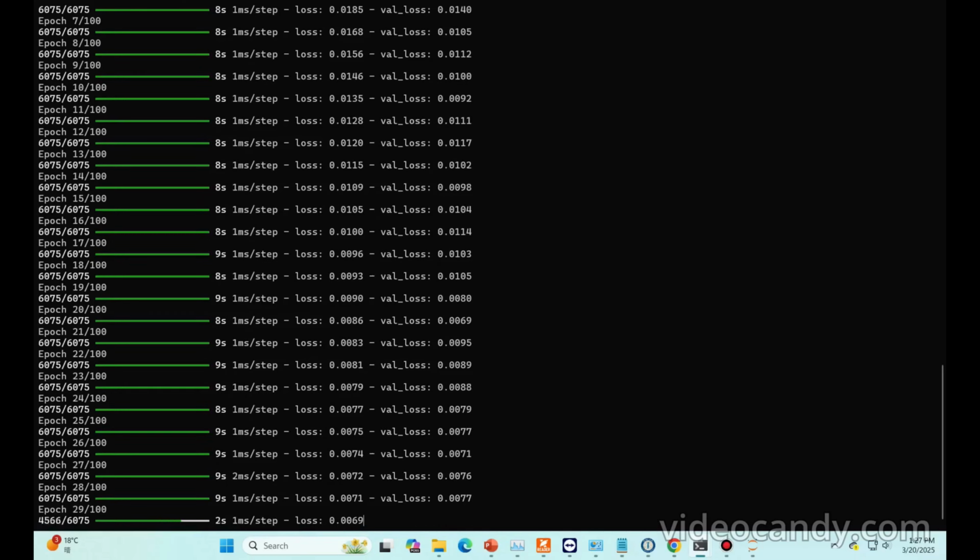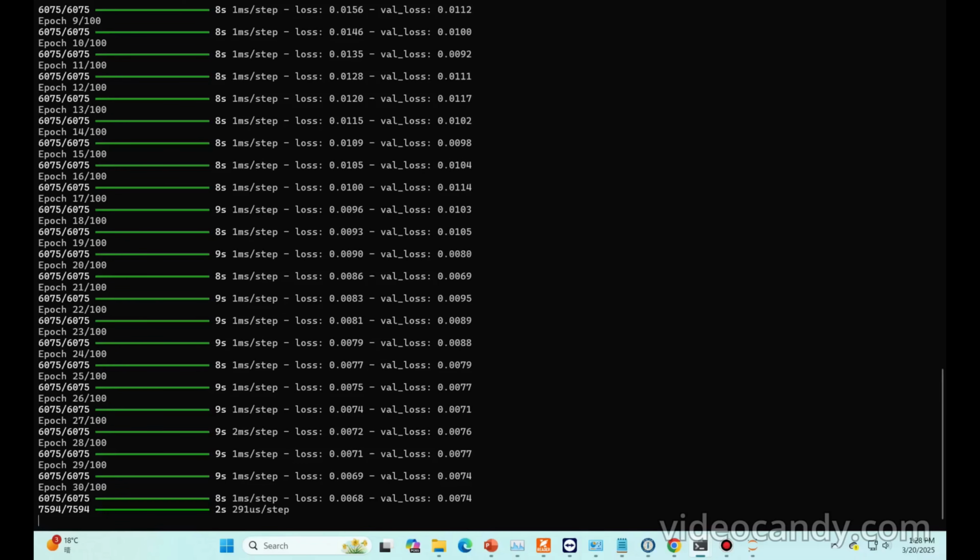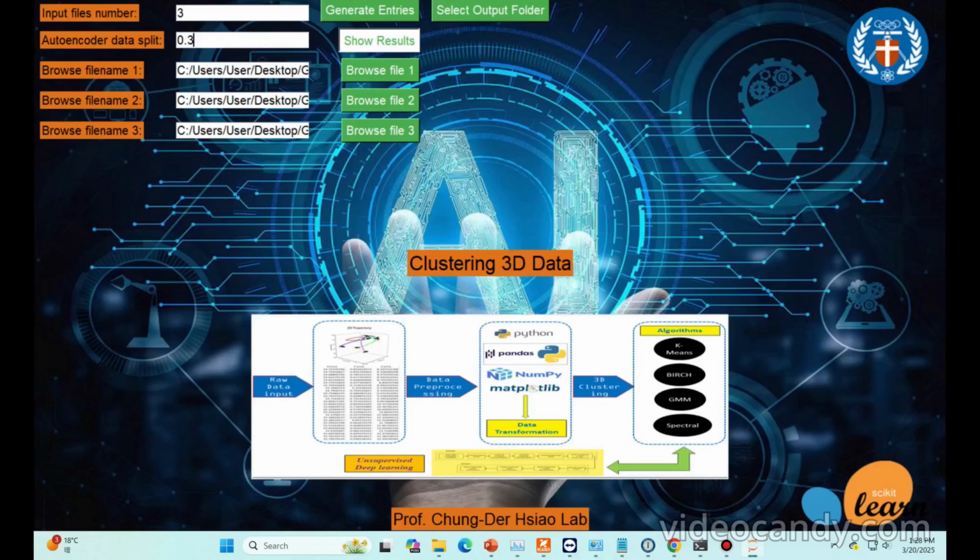Most probably it depends on the type of data sets and also the species. For example, if you want to analyze another zebrafish strain, or other species, for example different aquatic animals, but this data set is trained based on zebrafish data.